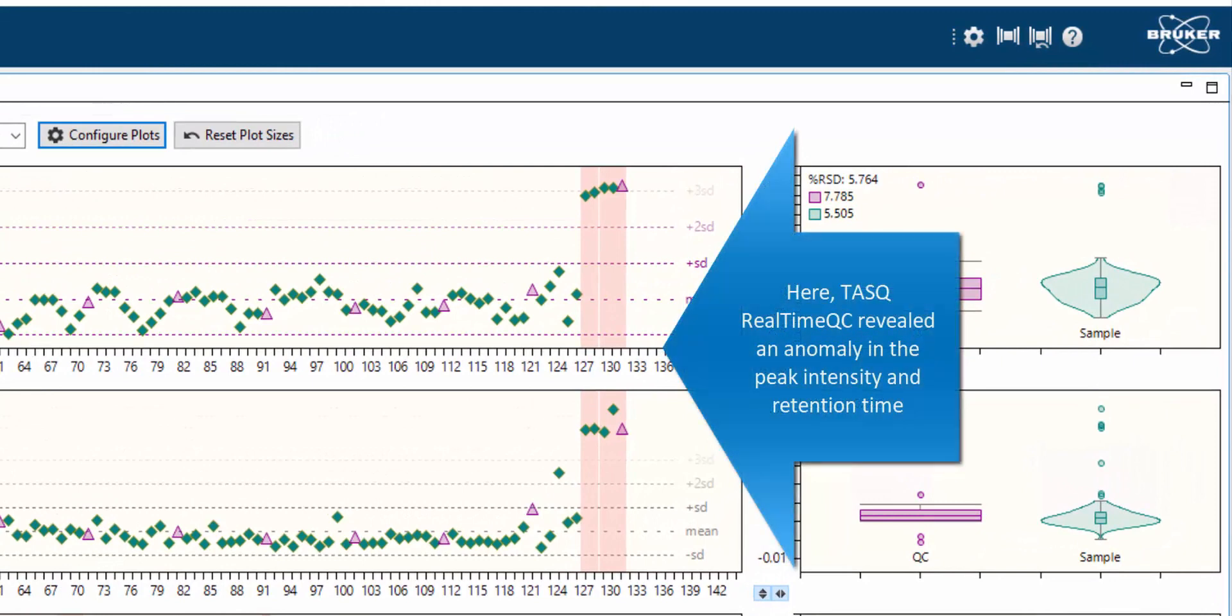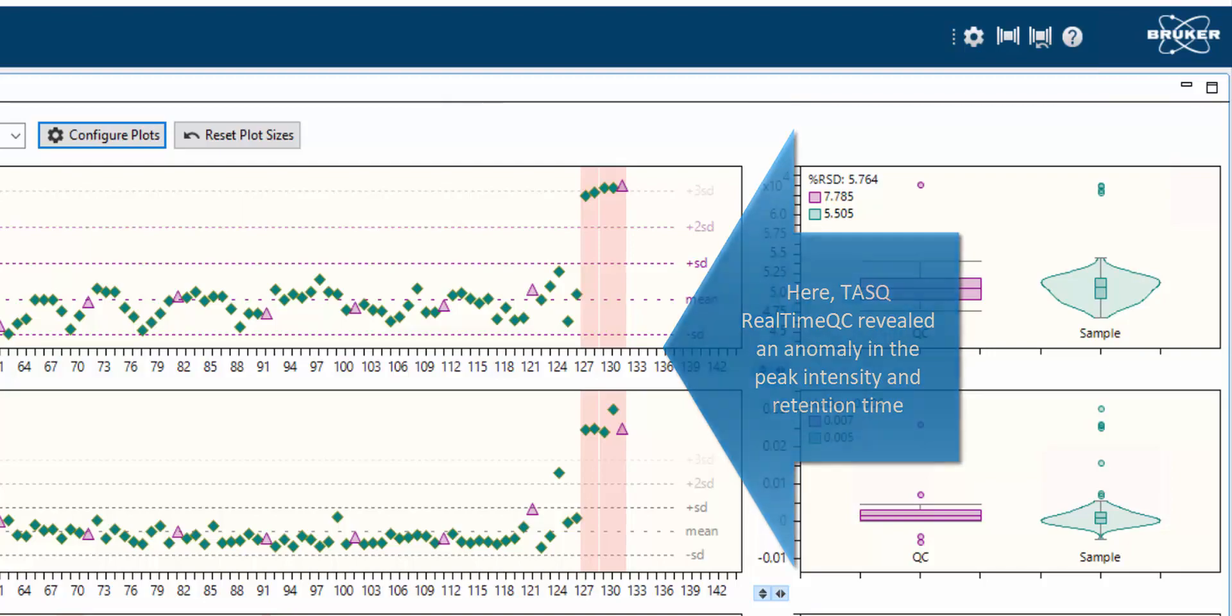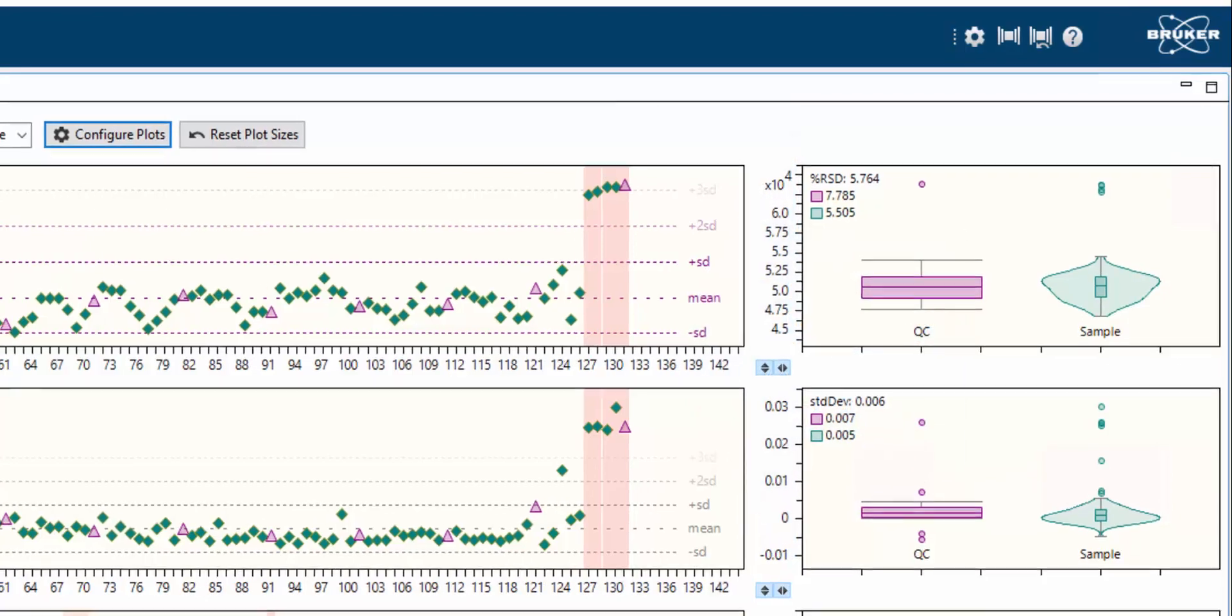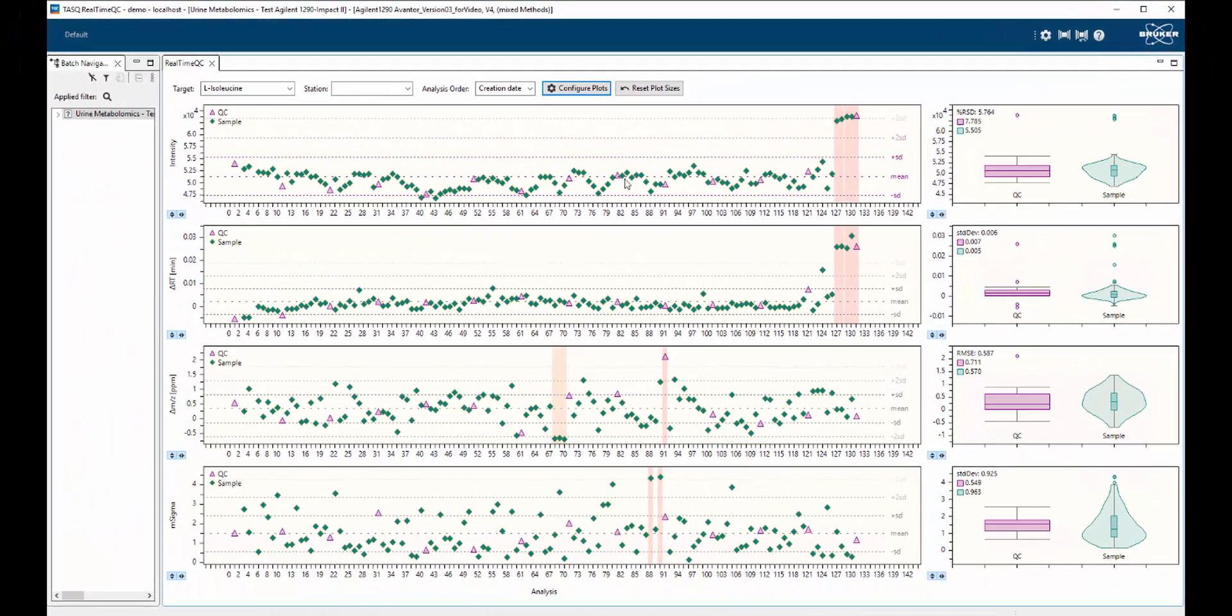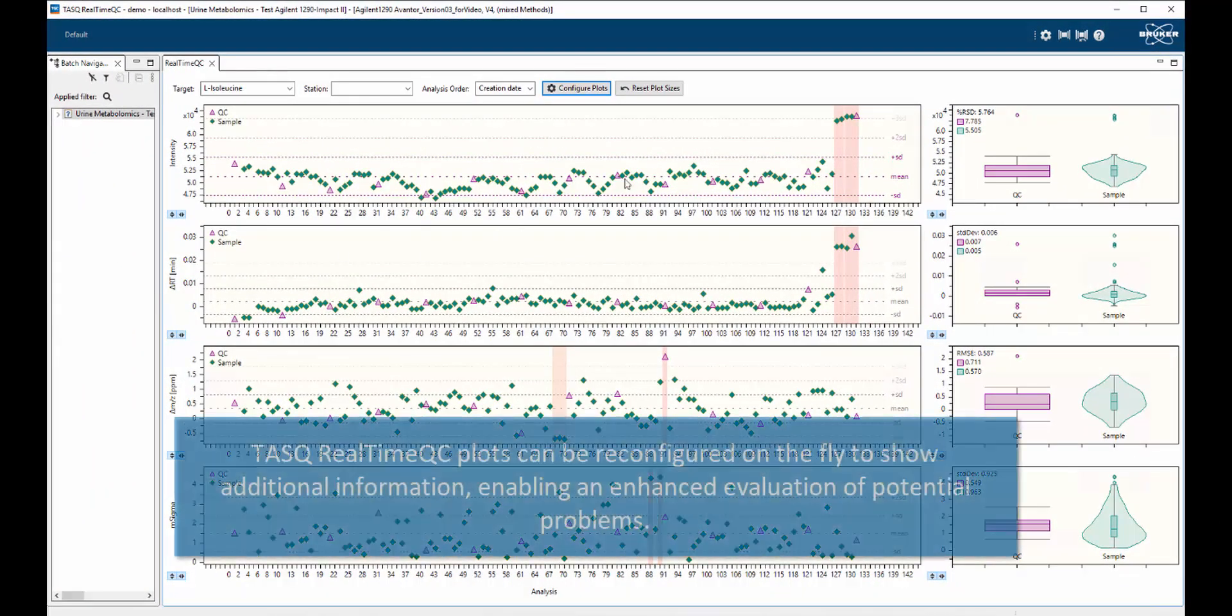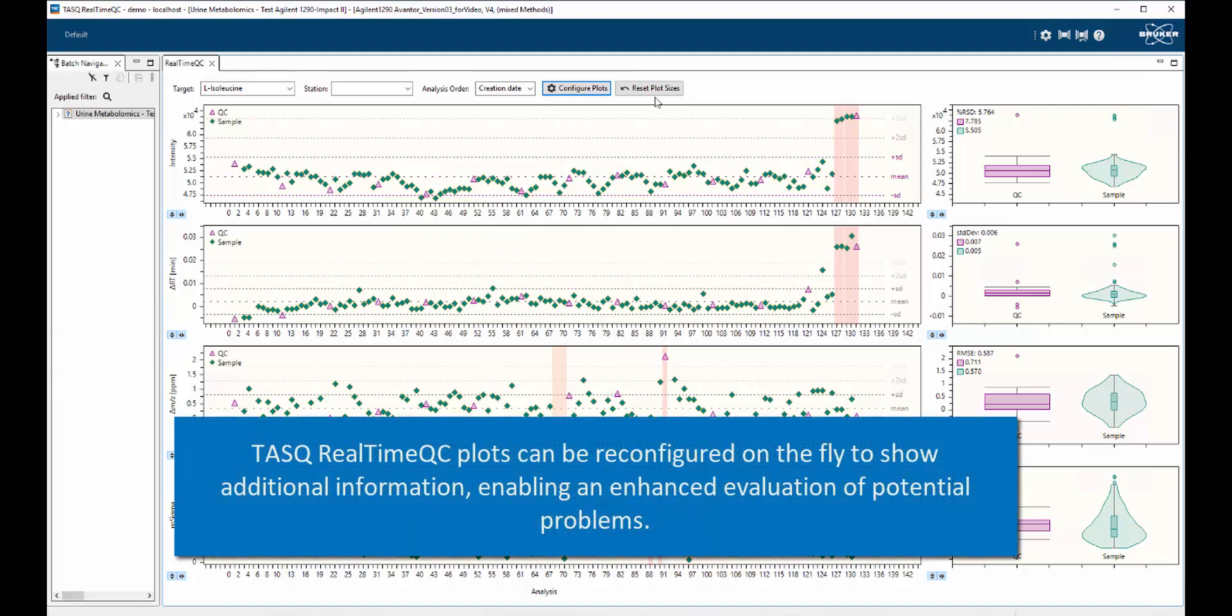At this point in the analysis, it has become clear that the LC peak intensity for isoleucine has increased beyond the bounds of random variation observed, indicating a potential issue with the LC-MS system.